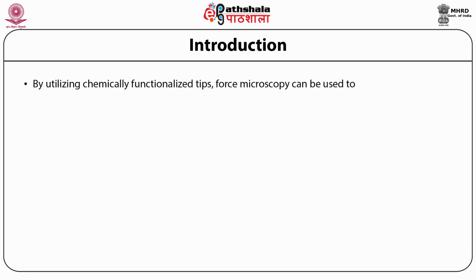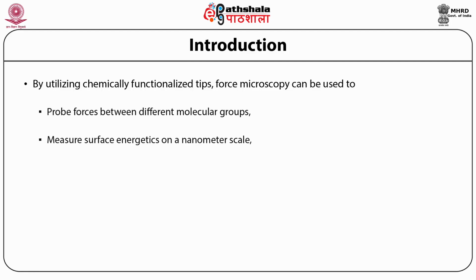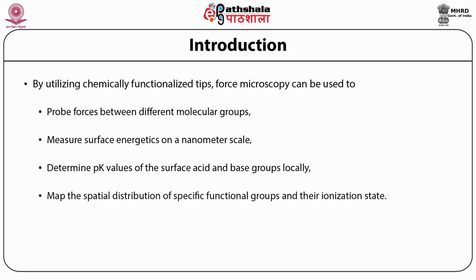By utilizing chemically functionalized tips, force microscopy can be used to: A, probe forces between different molecular groups; B, measure surface energetics on a nanometer scale; C, determine pK values of the surface acid and base groups locally; and D, map the spatial distribution of specific functional groups and their ionization state.